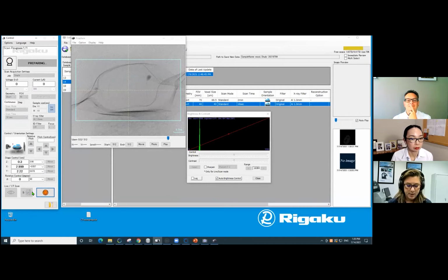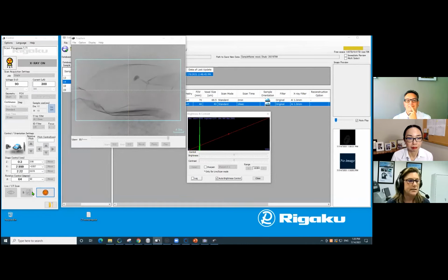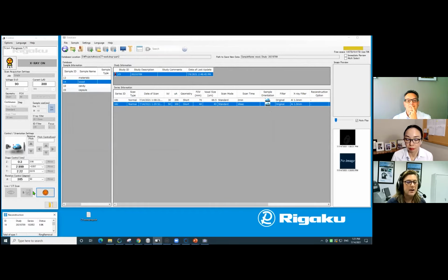Okay, just to let you know, this is a Snickers, one of these little trial size ones. Basically it has some chocolate, some nougat, some caramel, and some peanuts all inside. So we would expect to see several different phases for each of these materials if this was the real candy. And we can tell, cheating by looking at that radiograph, that we don't see very much other than just the wrapper. Somebody's going to be very sad when they take a bite out of that Snickers.